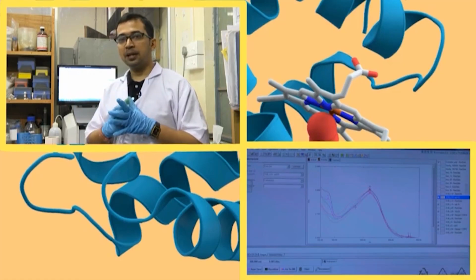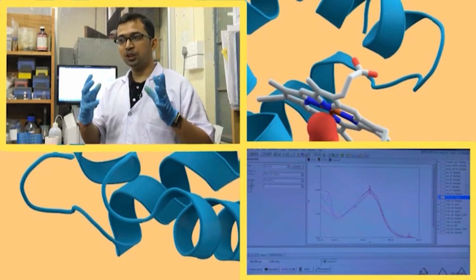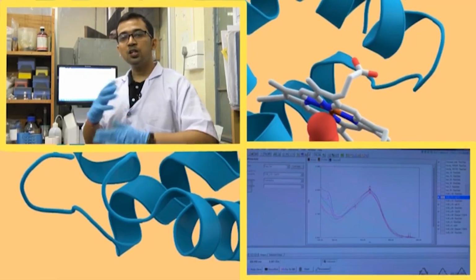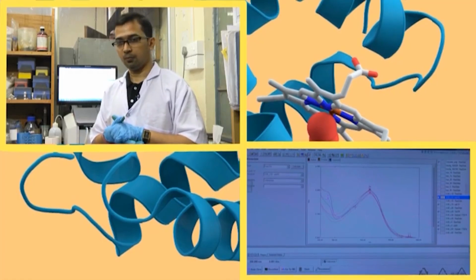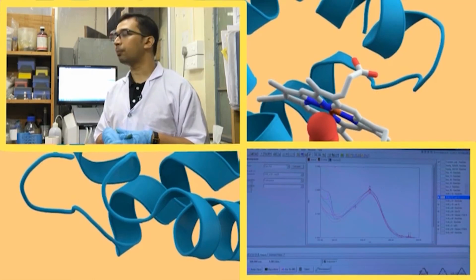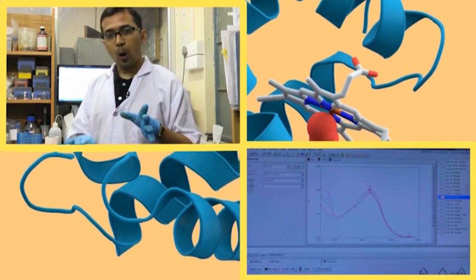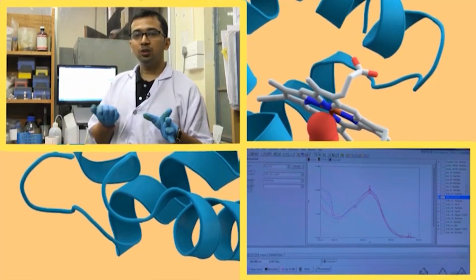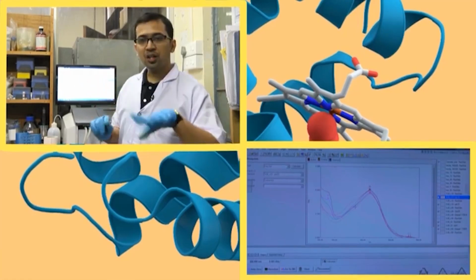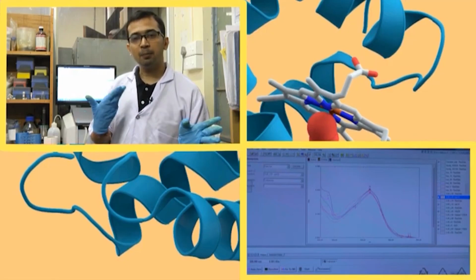While it is getting precipitated, as you know from Lambert-Beer's law, the concentration of the solution is measured only for the solute which is homogeneously mixed in water, or in the solvent. Out here it is not homogeneously mixed, and something is coming down in the solution, so the absorbance value we are getting is much lower. What we can say is the initial curcumin absorbance value we got without HSA should have been a bit higher.